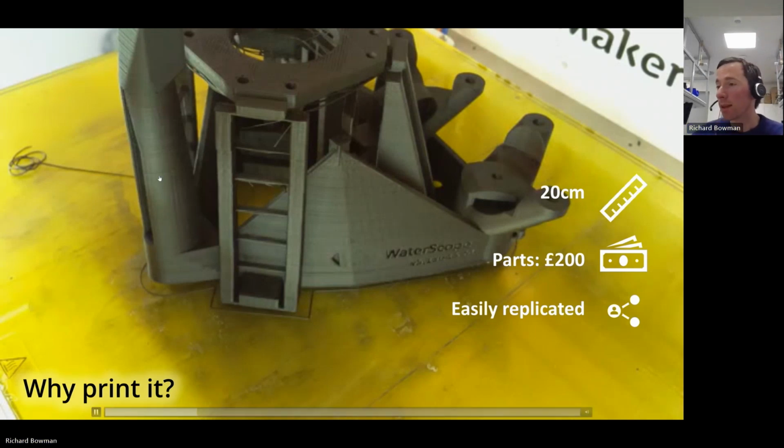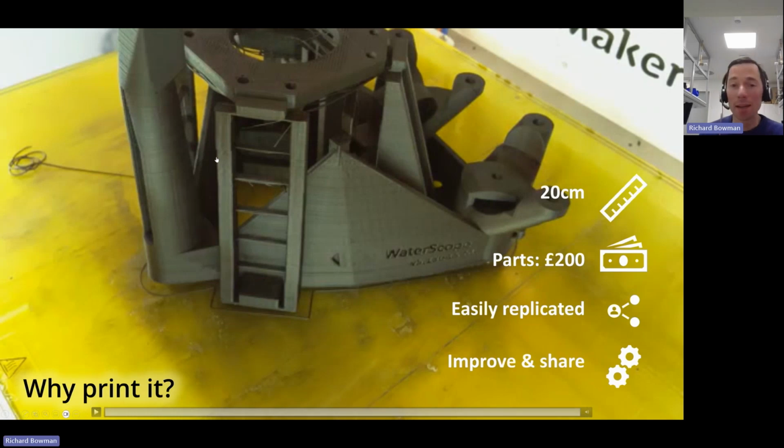And lastly, because it's easier to replicate, because 3D printing and so on decreases the barrier between the digital design and the physical reality, people can make them, improve them, share those improvements back with the community.